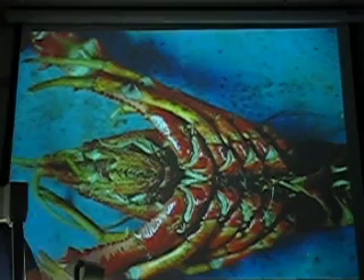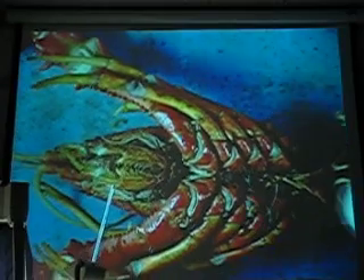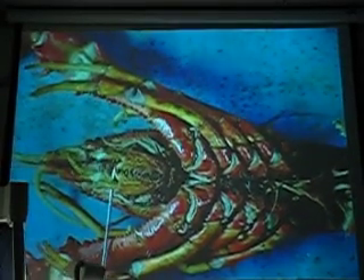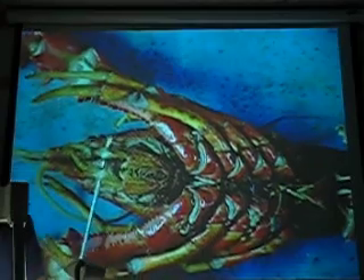Isn't that a mouth of a great fish? It's kind of scary. What's the scary one, right here? Big one. Way out here, look at this. Maxillipeds. Maxillipeds.